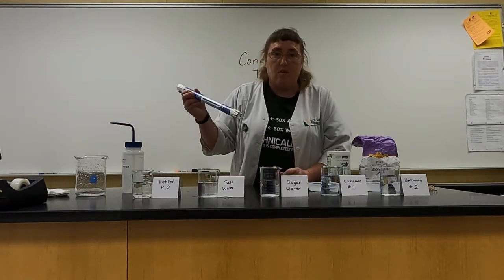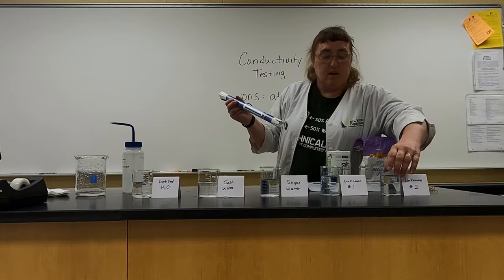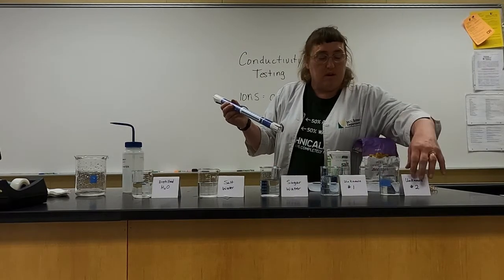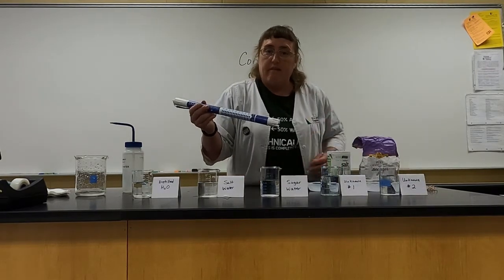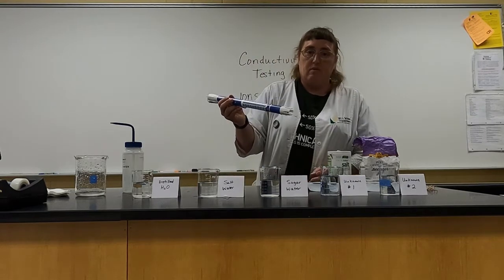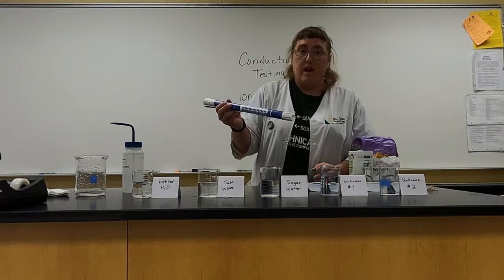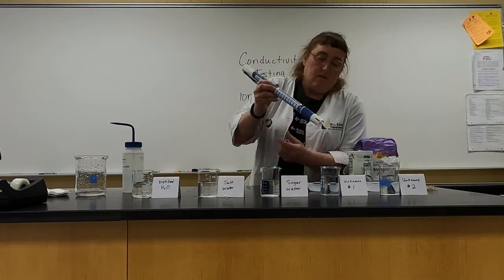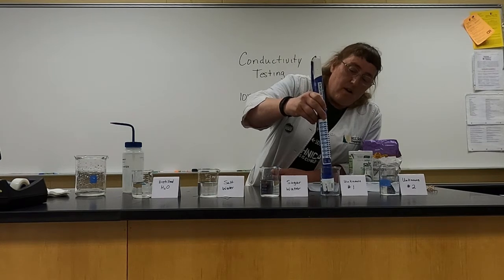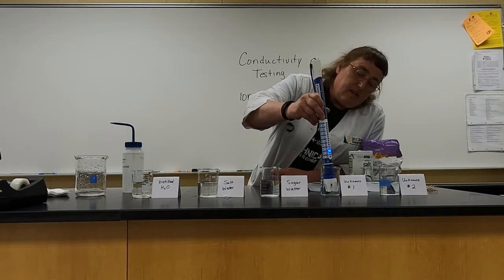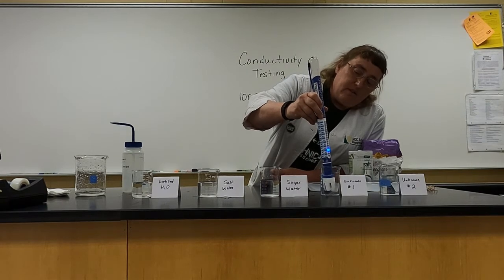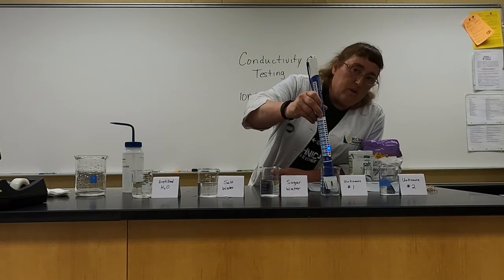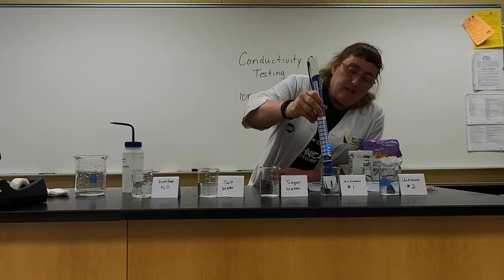Your job now is to figure out whether unknowns number one and number two have ions in them, and which one would have more ions. Let's put it in unknown number one — you can see it's blinking at the fourth light up. So we do have some conductivity. You're going to be asked to explain that in your lab.